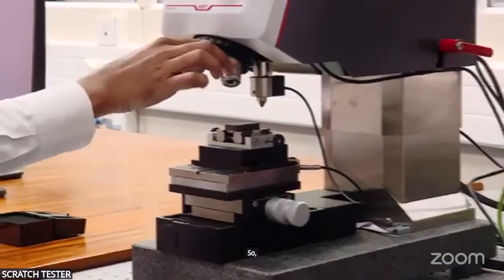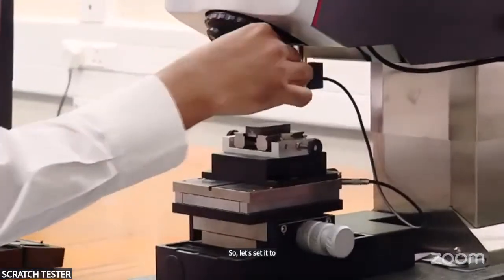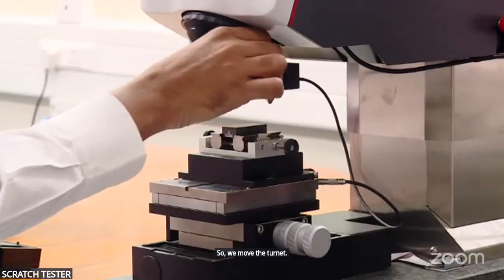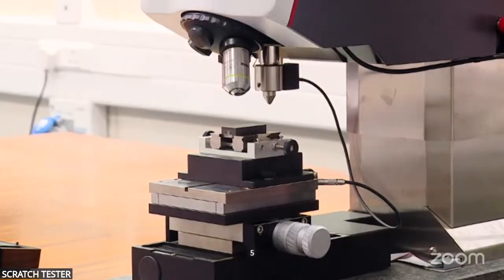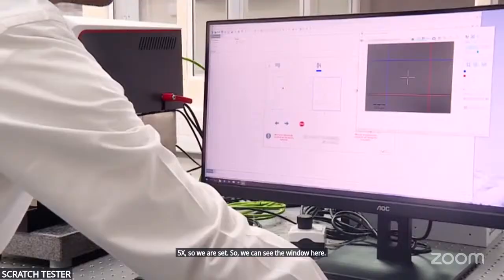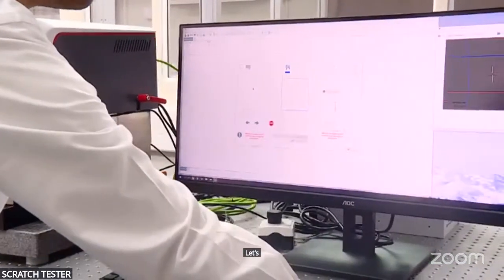Let's set it to 5x. So we move the turret to 5x, and we are set. We can see the window here. Let's set it to auto brightness.